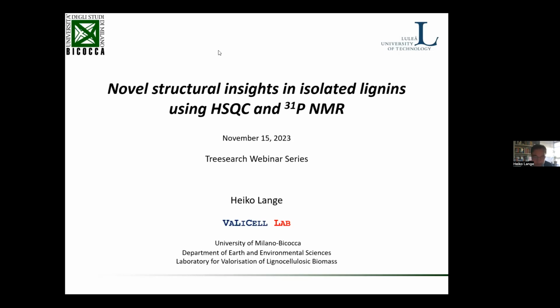I'm very happy to be part of this webinar series on the NMR analysis of, in my case, isolated lignins. The techniques that I will show you, the HSQC and the phosphorus NMR, are generally, and that's an important point, generally applicable to polyphenols. So I'm talking about lignins, but whatever I tell you, you can eventually adopt also to the field of tannins, or even eventually to lignans. So please keep it in mind that I'm talking about lignins, but it's generally applicable.